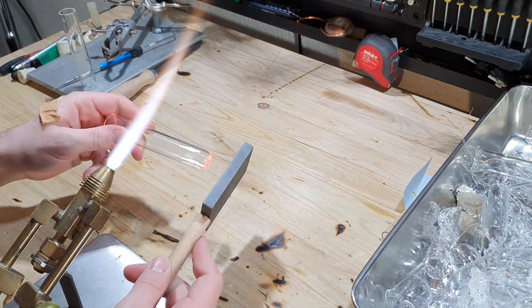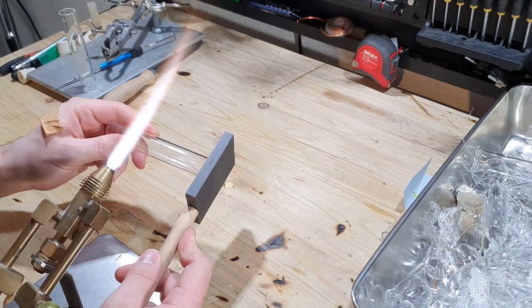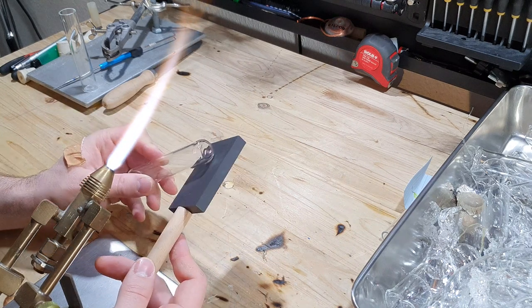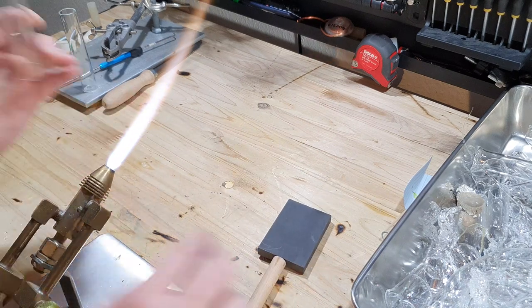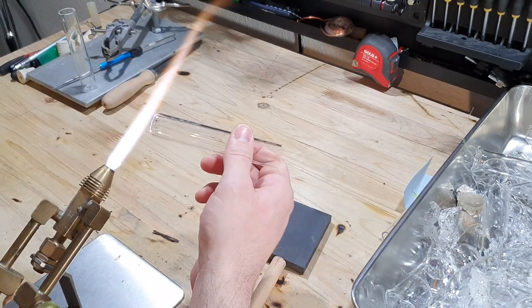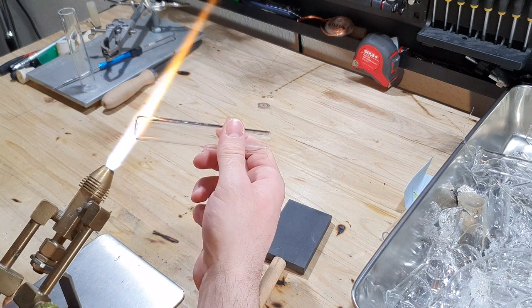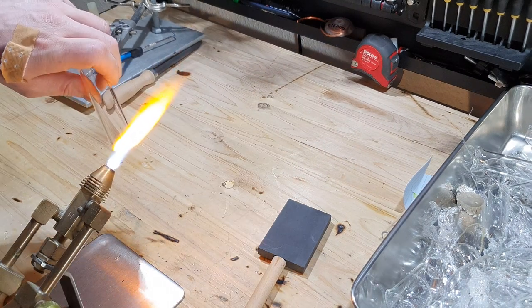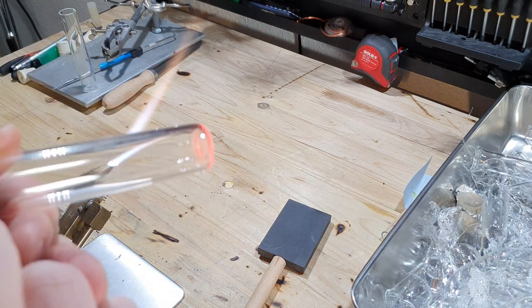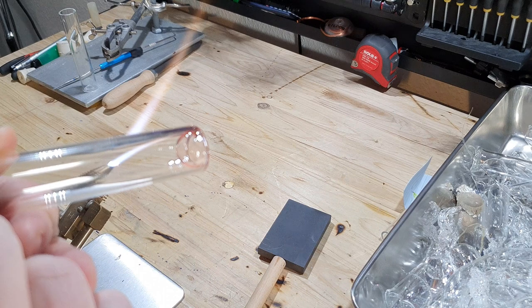I am then using a graphite tool to flatten the end of the tube. I then reheat the end of the tubing and suck on one end of the tube to create a bubble.